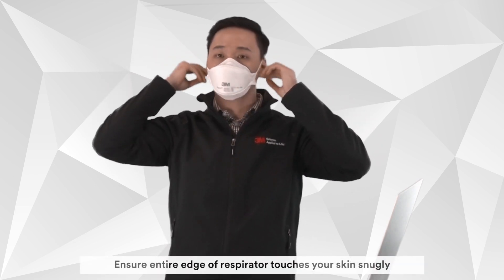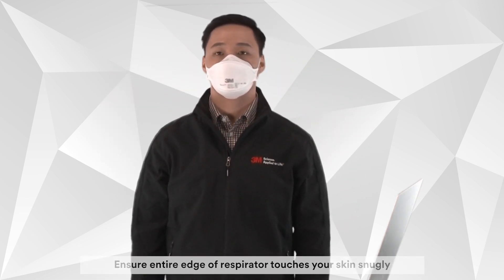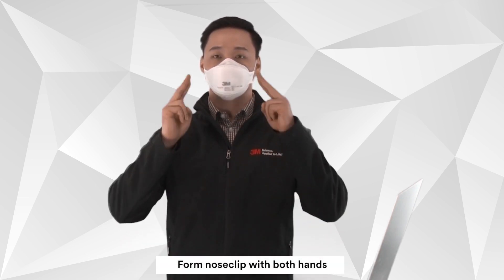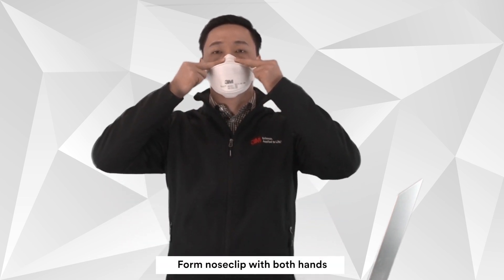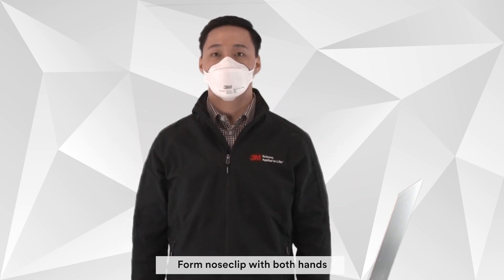Be sure that the entire edge of the respirator touches your skin snugly. You need to have a seal around your nose, so form the nose clip firmly to your nose with both hands. Do not use one hand and do not pinch.